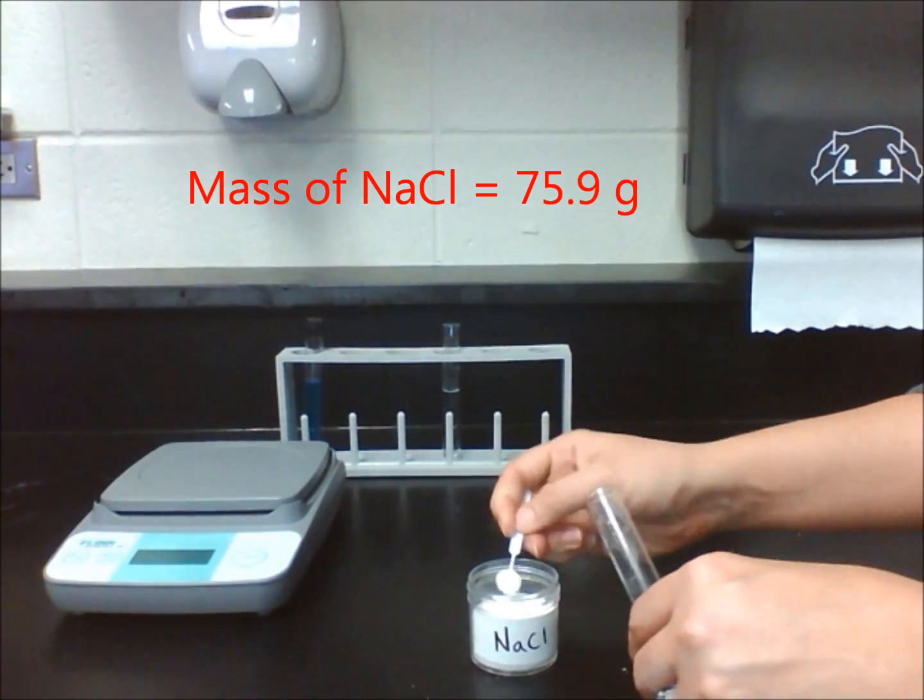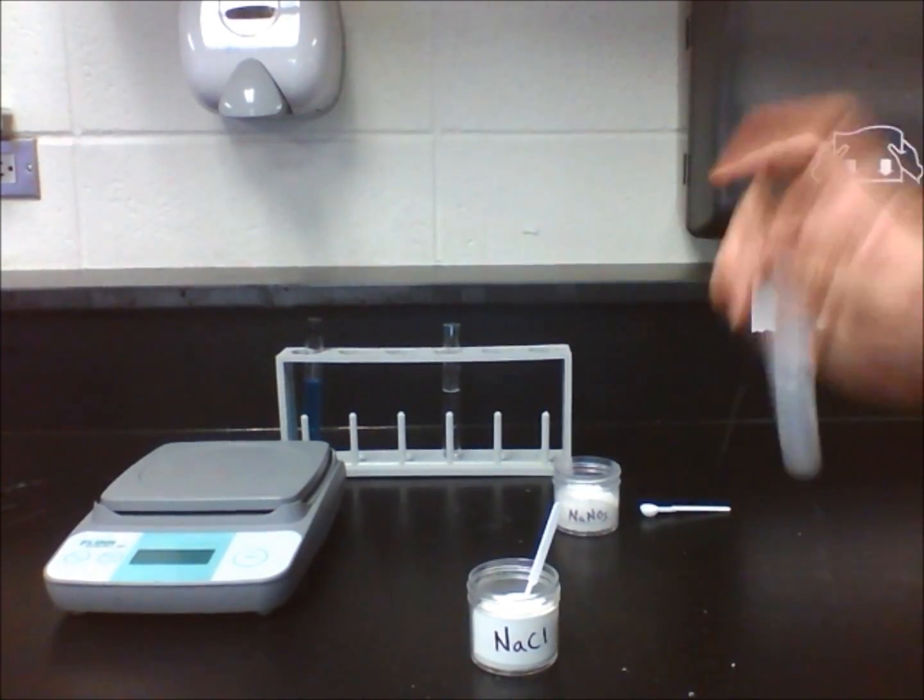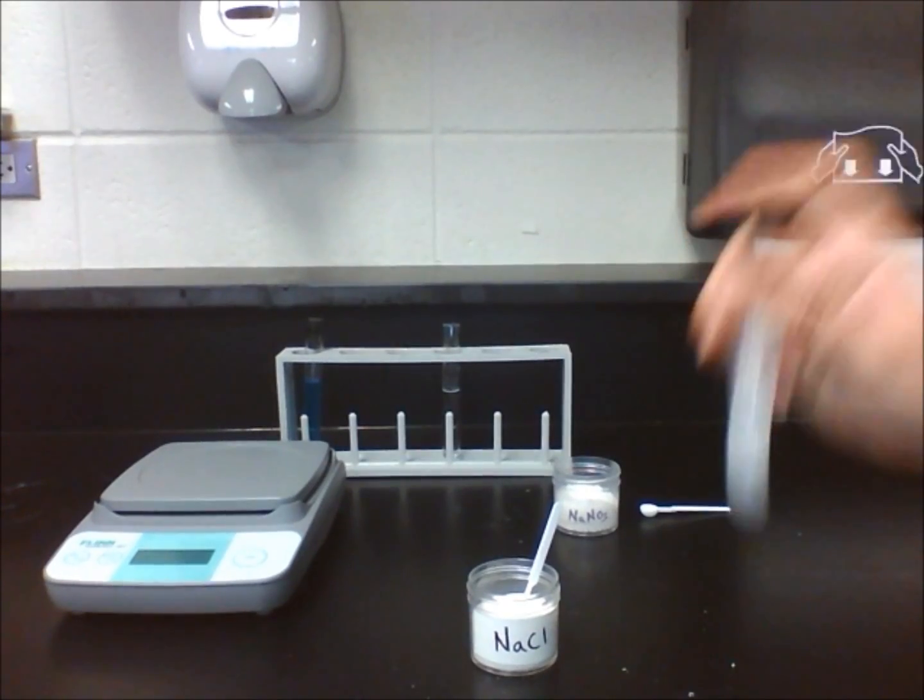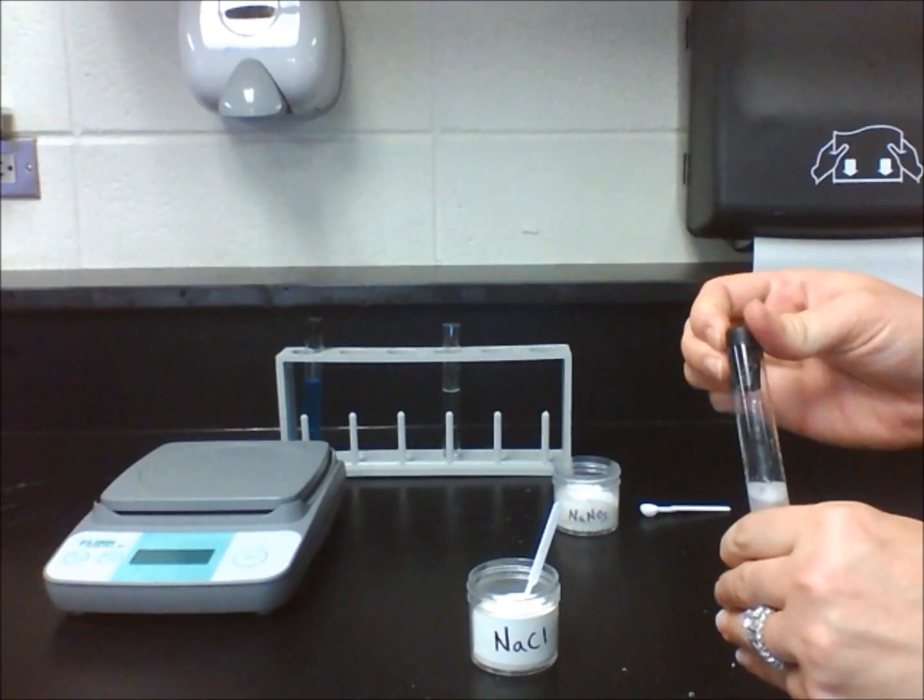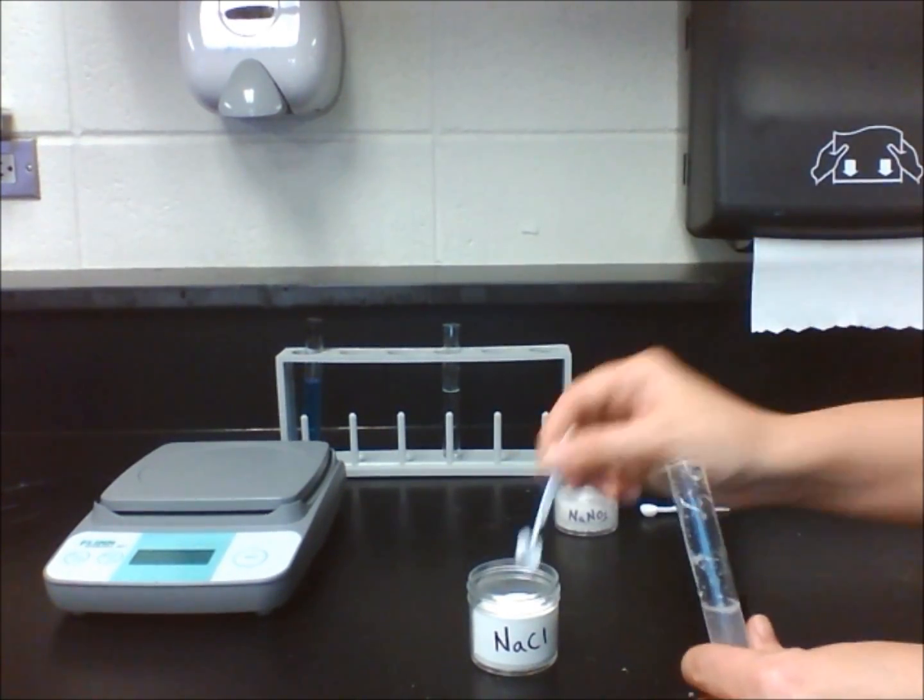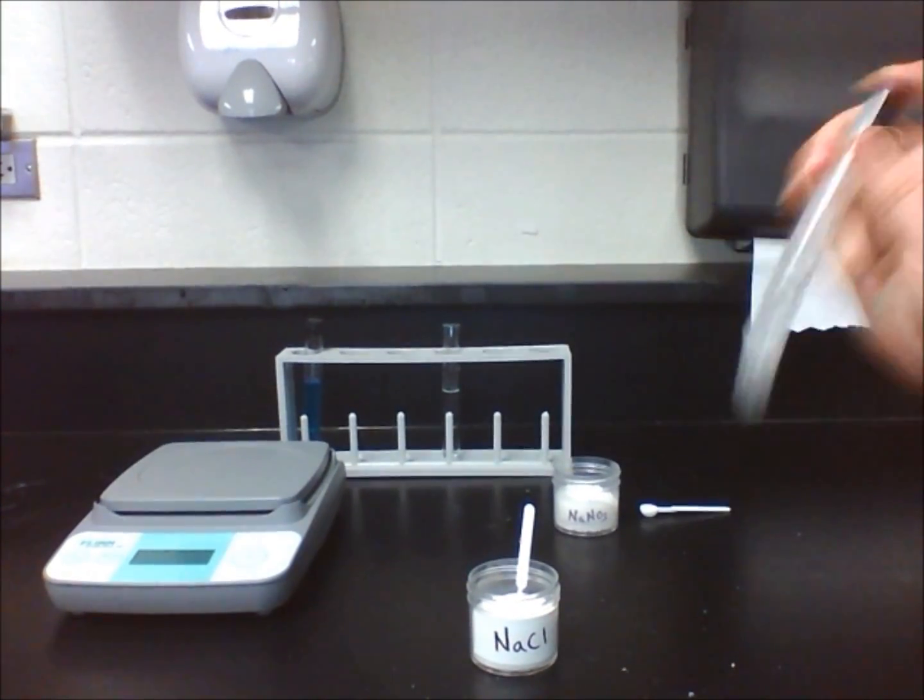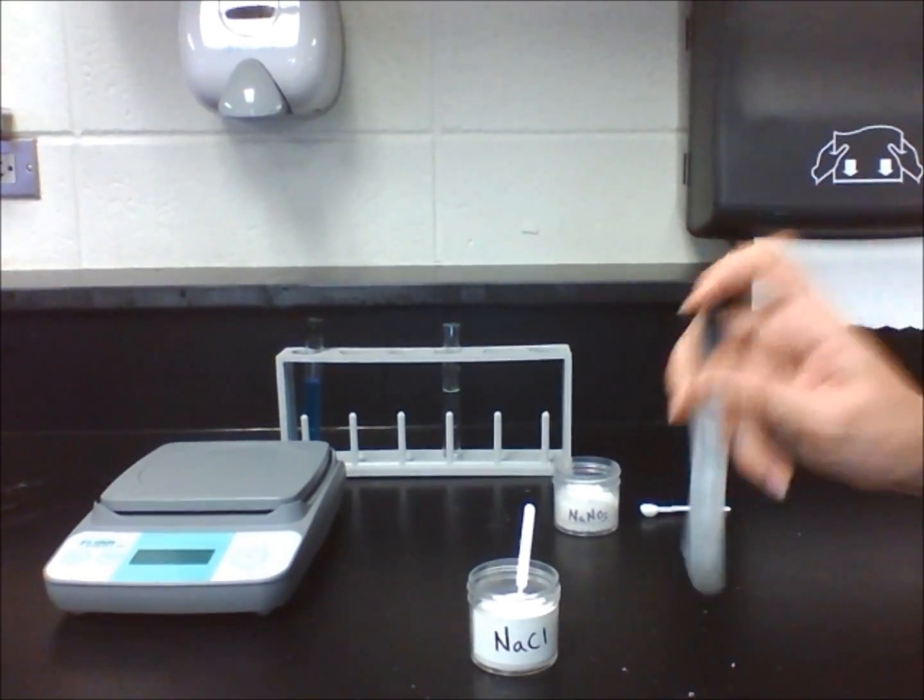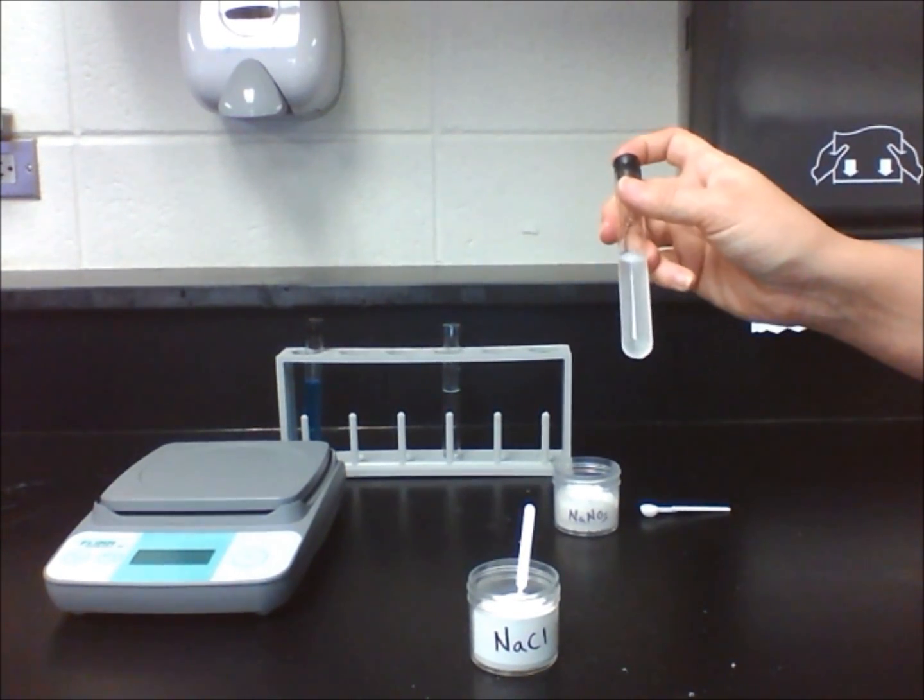Keep adding scoops one scoop at a time until no more can dissolve so that we have a saturated solution. Once we do have a saturated solution, mass the jar of salt on a scale, then record the mass. Subtract the original mass minus the new mass to get the mass dissolved.